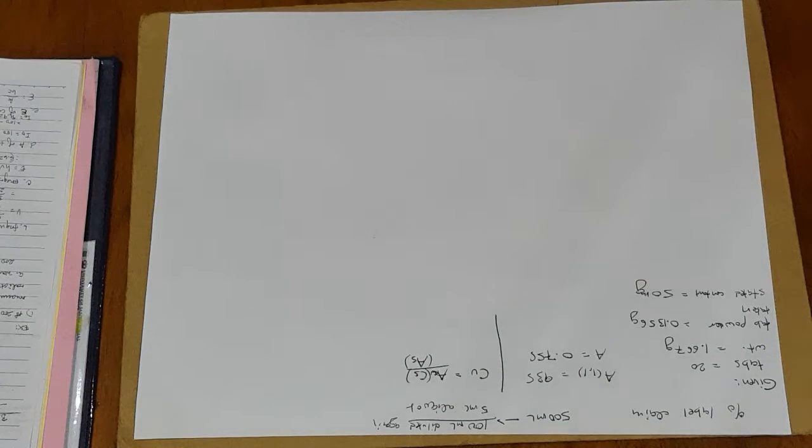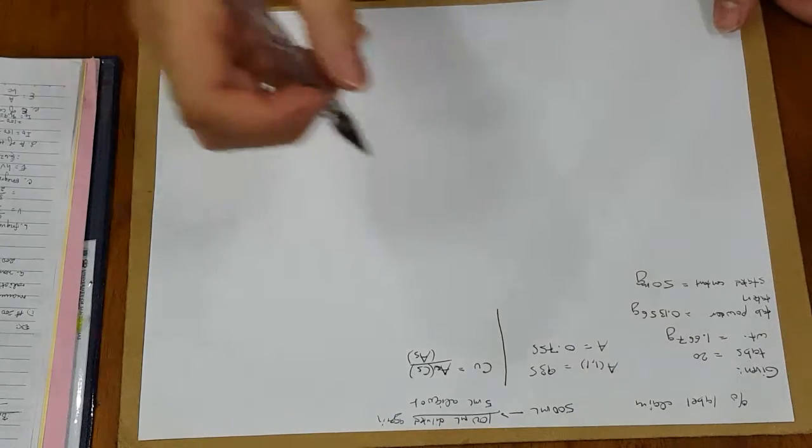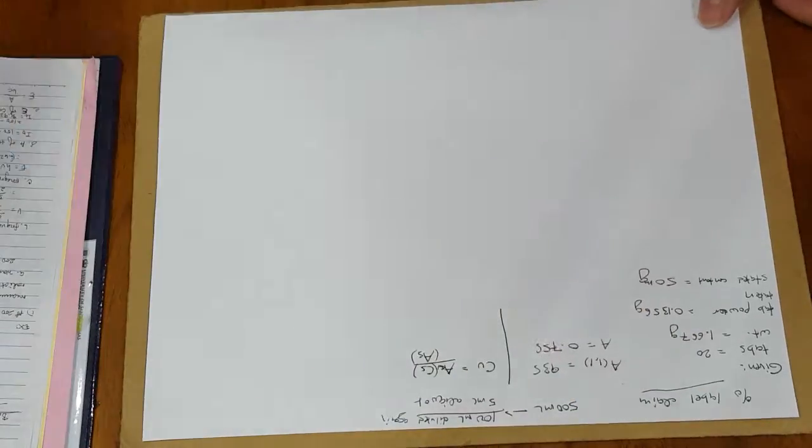So here we have our last example for UV vis. Here you can really see the application of the formula we discussed before. So basically what we do in our laboratory is we get a couple of tablets, we get the total weight, we get a portion of those tablets, and then we get its absorbance through UV vis spectrometry, and then we solve for percent label claim.